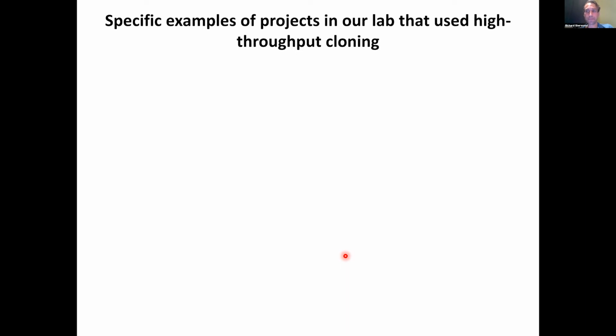There have been a lot of tools that identify sequences that might be unique to each gene. I could follow up after on the specific links to them, but there's a whole host of them that have different features depending on what you want to do. I'll talk about one that our lab has created in a few slides. But for CRISPR, the main thing is identifying valid target sequences in the genome. And then it really depends on the project.